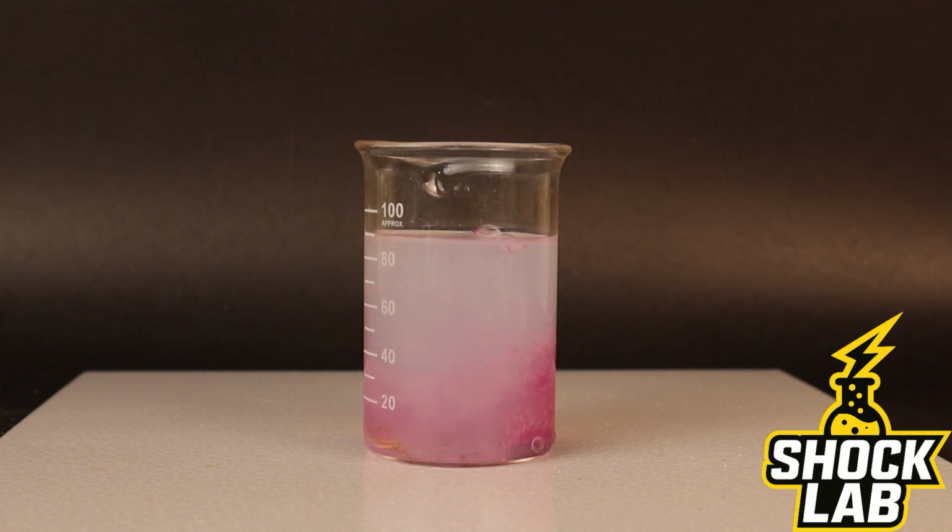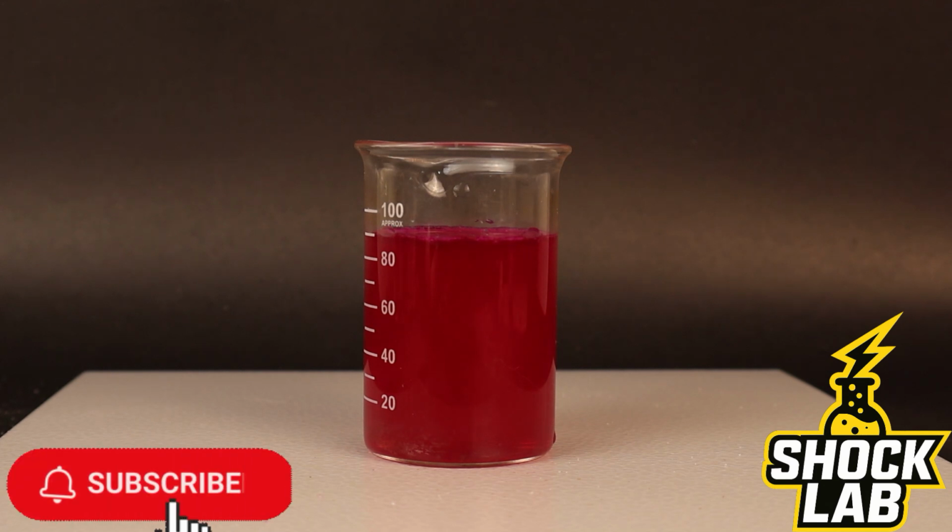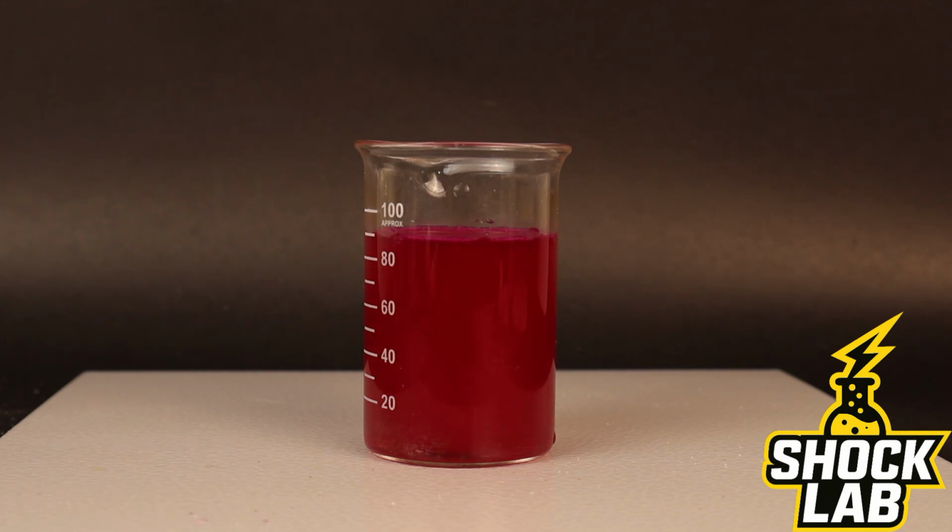Welcome to Shock Lab. Today we're exploring how pH indicators reveal chemical changes through a series of dramatic color transformations. Our experiment begins with a solution of distilled water and phenolphthalein. At this stage, the solution is completely colorless.